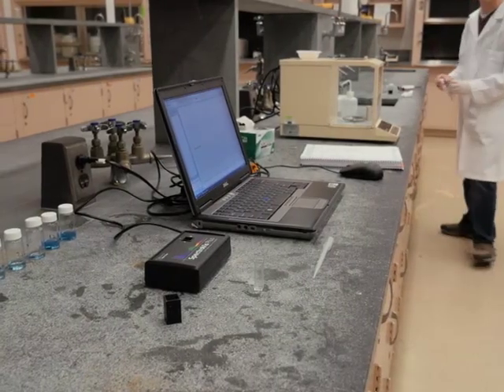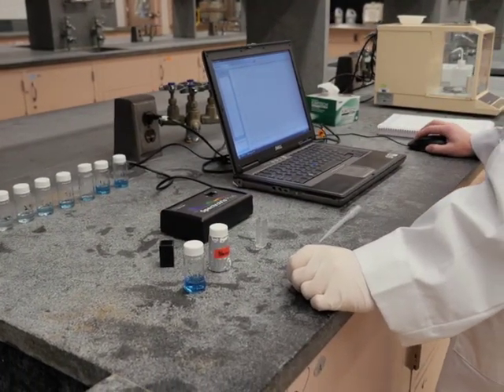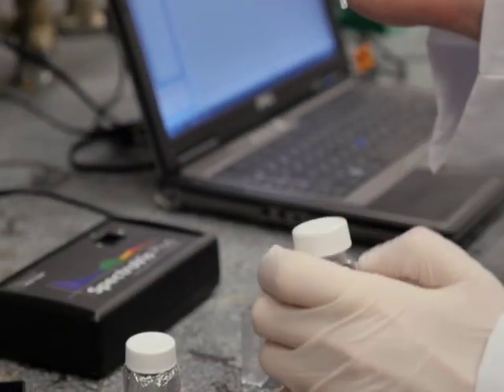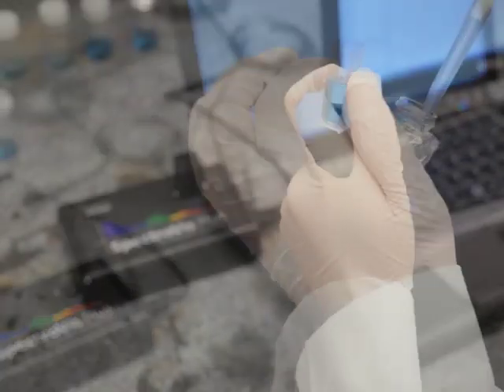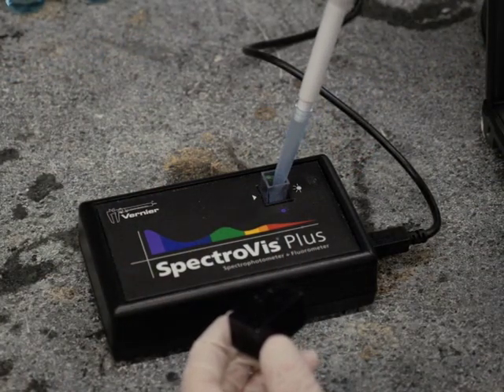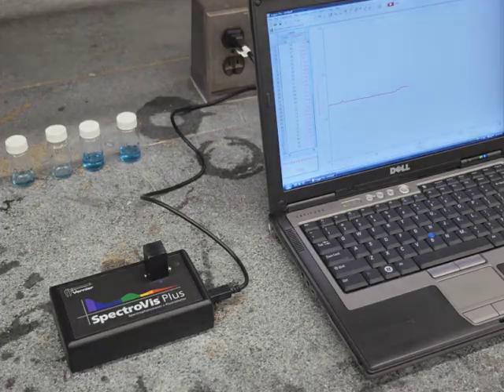The absorbance measurement can also be used to calculate reaction kinetics by measuring the increase or decrease in a compound's concentration throughout the reaction. Begin by taking an initial reading of the sample, blue dye in this case, at the absorbance maximum before the reaction. Next, quickly add the reagent, bleach in this case, to start the chemical reaction. Stir it well so that it mixes with the sample. Measure the absorbance at the absorbance maximum over time.